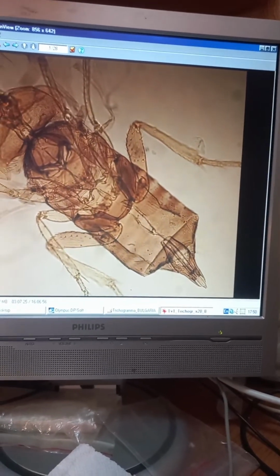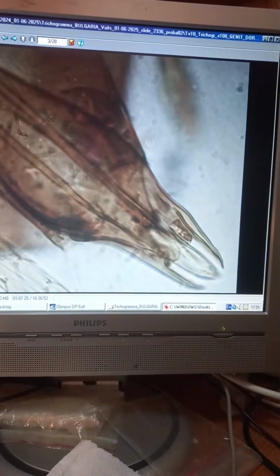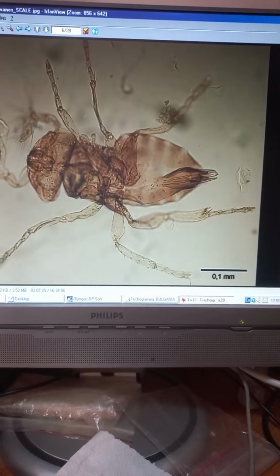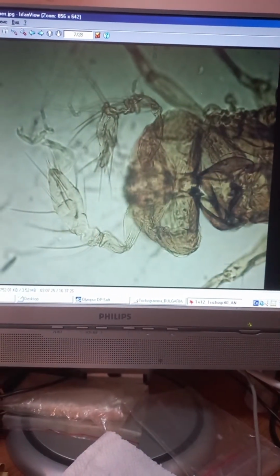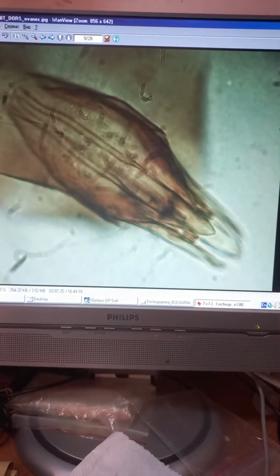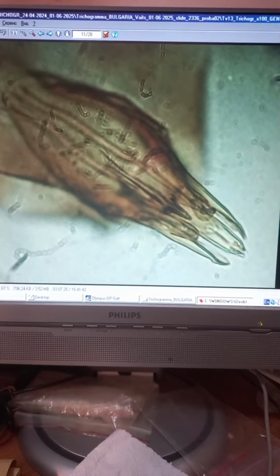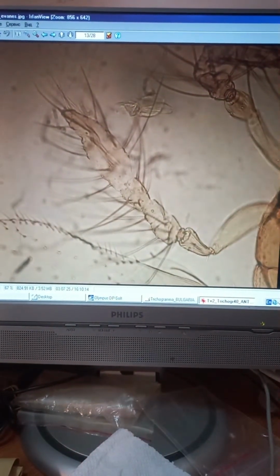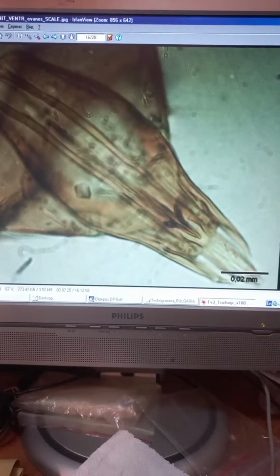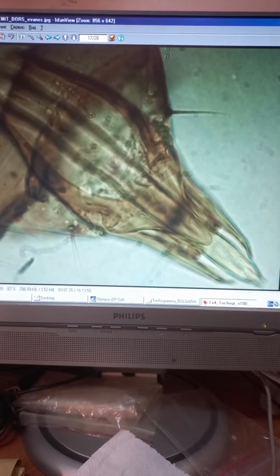body of evanescens with male genitalia. What we can see here? Okay, male genitalia. This is a small individual. Very small one, with short antenna. Antenna is very short. Individual is very small and genitalia is smaller. This is dorsal aperture. Ventral aperture. This is antenna of male. Very sharp ventral aperture. Very wide dorsal aperture.